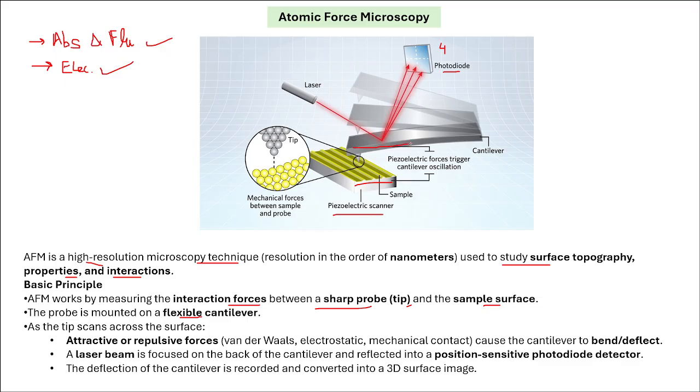Now, this cantilever is flexible in nature, meaning when it moves, suppose it's moving like this. So when it is flexible, suppose there is a rough surface. Suppose this is a nanoparticle. Now, when this cantilever moves, it will deflect a little, and then move like that. When it deflects at this point, this cantilever will also bend, and there will also be bending of the laser light that is falling on this cantilever.